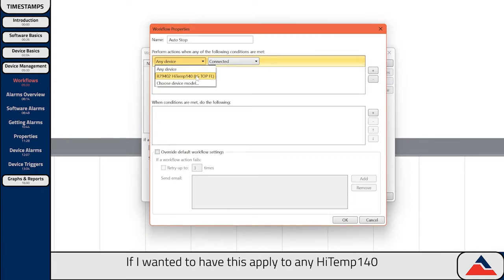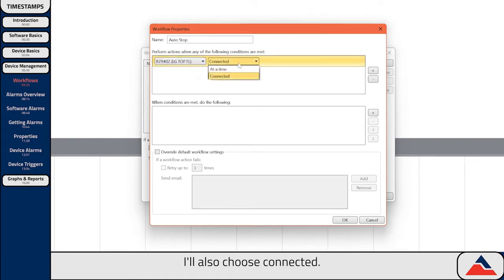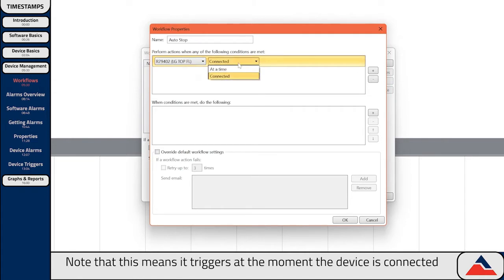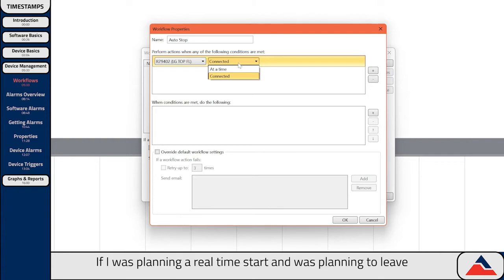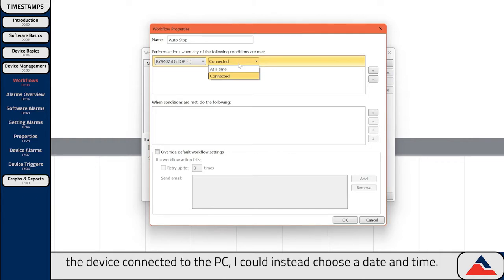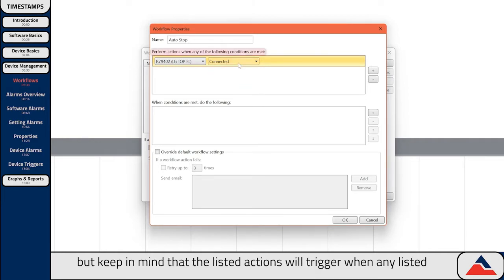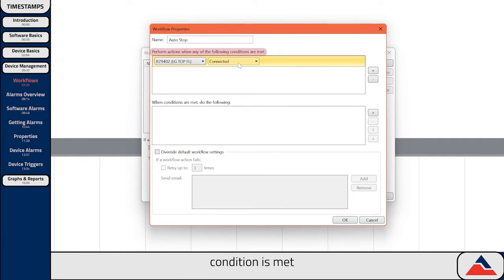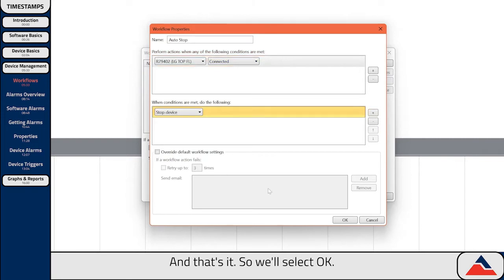If I wanted to have this apply to any High Temp 140 I connected, I would instead select Choose Device Model. I'll also choose Connected. Note that this means it triggers at the moment the device is connected, and so will not be triggered until I reconnect the device. If I was planning a real-time start and was planning to leave the device connected to the PC, I could instead choose a date and time. You can add multiple conditions, but keep in mind that the listed actions will trigger when any listed condition is met. Now we'll select our action where I'll tell the device to stop recording. And that's it, so we'll select OK.